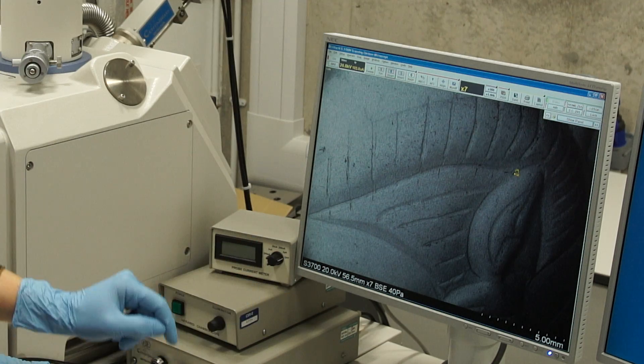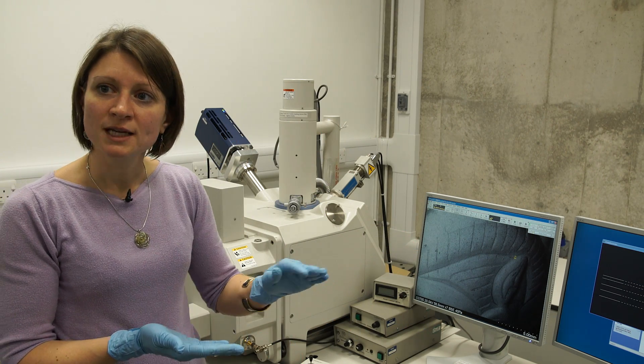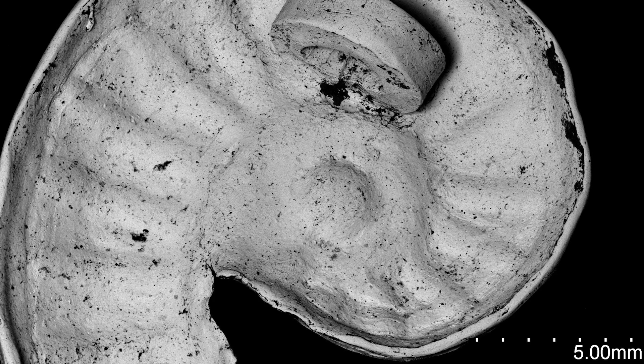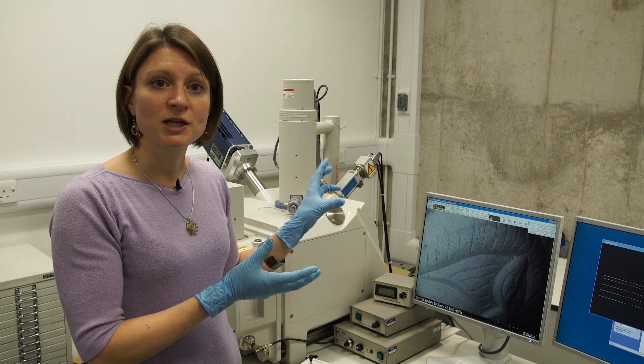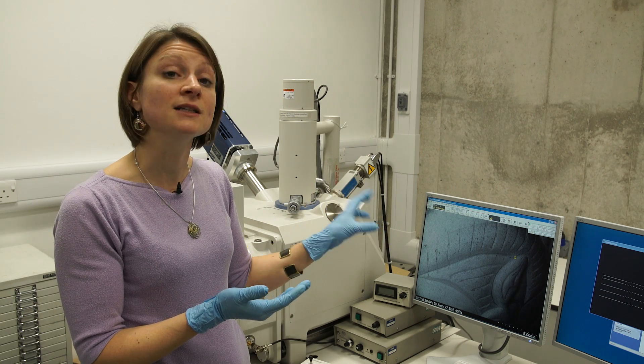Other grooves — I think the ones which we can see on the ear — they're much smoother. And so the tool that has been used is most probably with a blunt edge, and it has been gently pushed into the surface of the metal to create the groove instead of cutting through the metal. This is the sort of feature we're trying to look for in order to identify manufacturing techniques on objects.